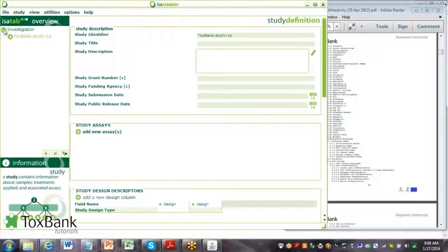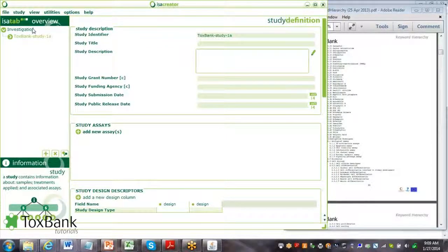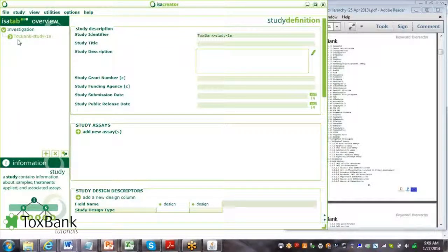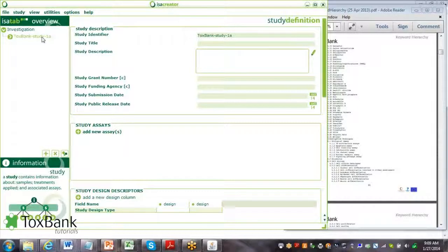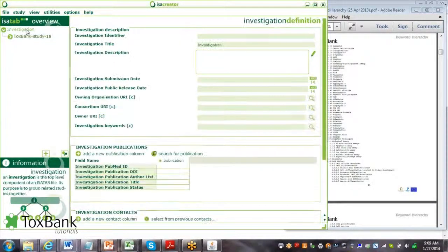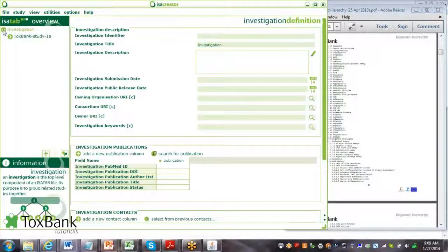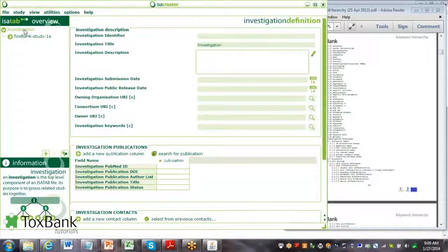You can see here it's created an investigation and under that investigation one study has been created. For this tutorial, we're just going to look at creating the investigation information.